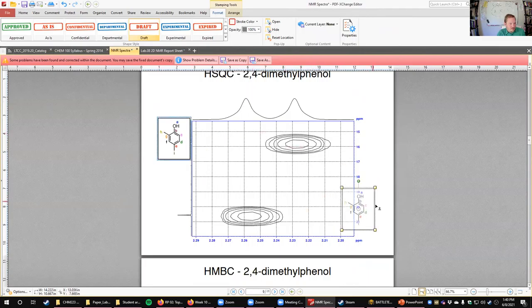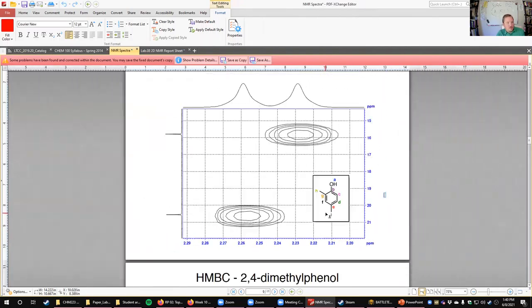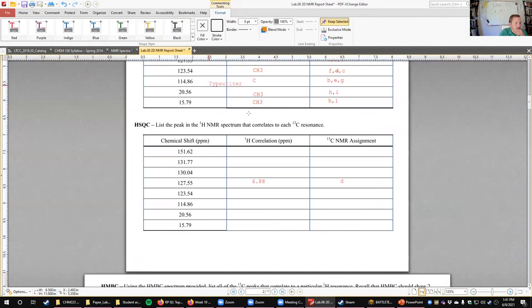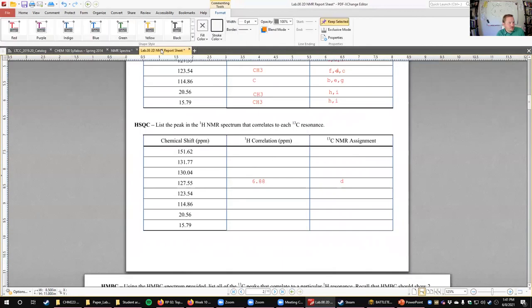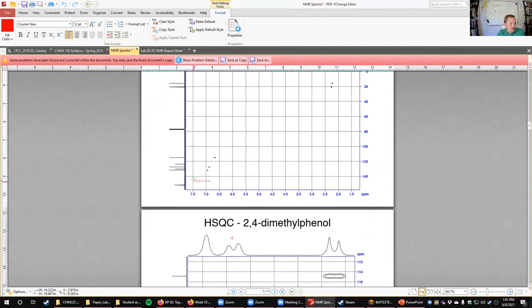And again, we still have not been able to say with 100% certainty which of the methyls goes with which. So at this point, this is not necessarily all that helpful. Once we can figure out any one piece of this, we can get the other three pieces. And as far as filling these out, we're just basically filling this in with everything we know.